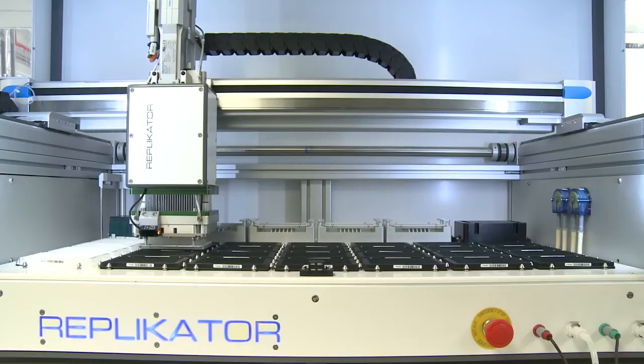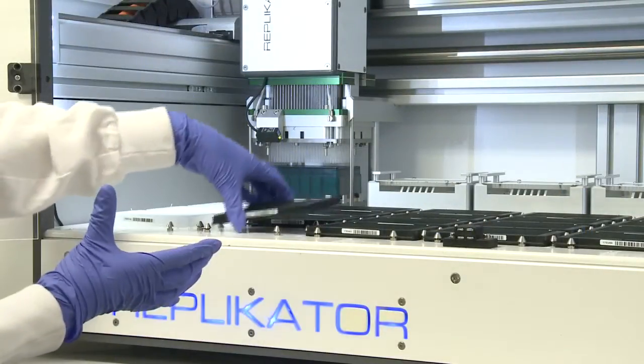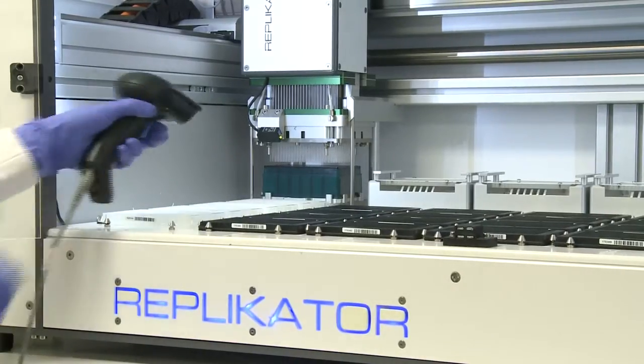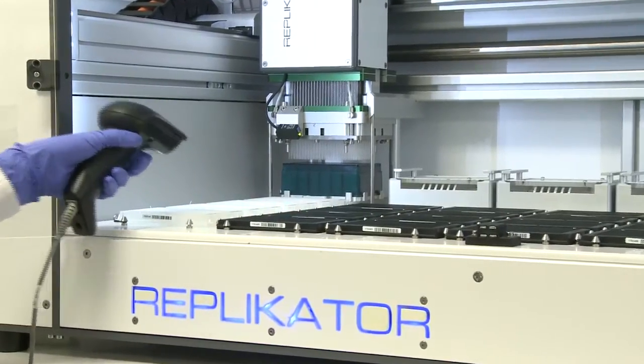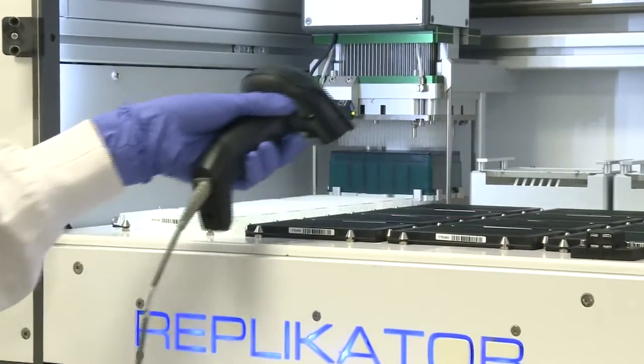Replicator is a fire and forget system. Just tell Replicator how many plates, where the liquid needs to go and how much sample there is — press, walk away — freeing up your valuable time, safe in the knowledge that completing laborious sample preparation and arraying is taken care of.